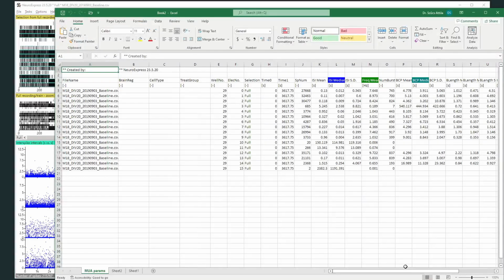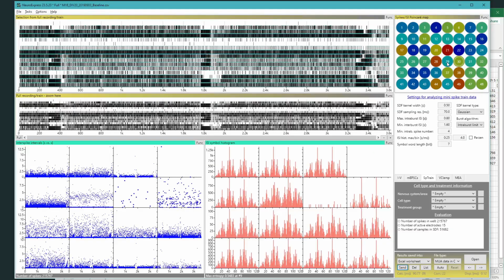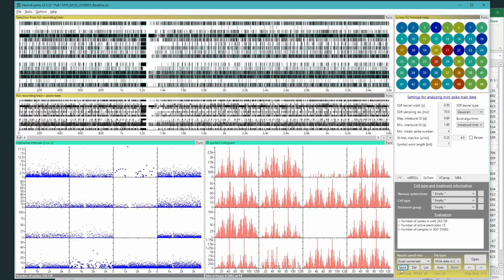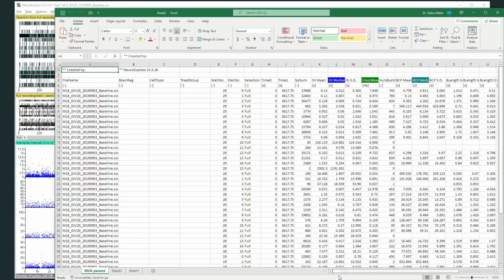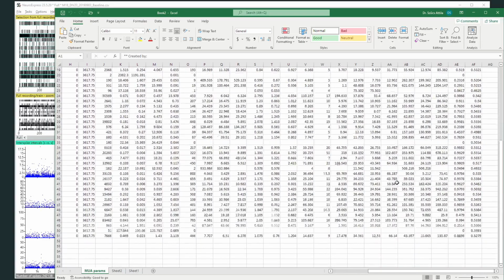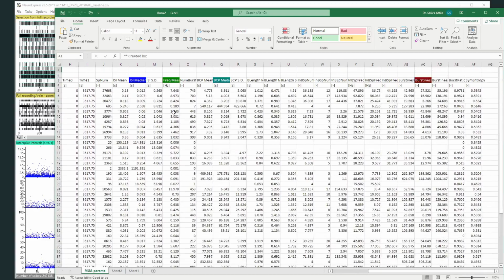We will obtain firing rate, burst cycle period and other parameters for each electrode in the well, and we can export the results for all wells that contain useful data. So next, like this, send again, send again. So this is a convenient output of the calculations from NeuroExpress, and then you can select the features and parameters that you are most interested in and perhaps ignore the others.